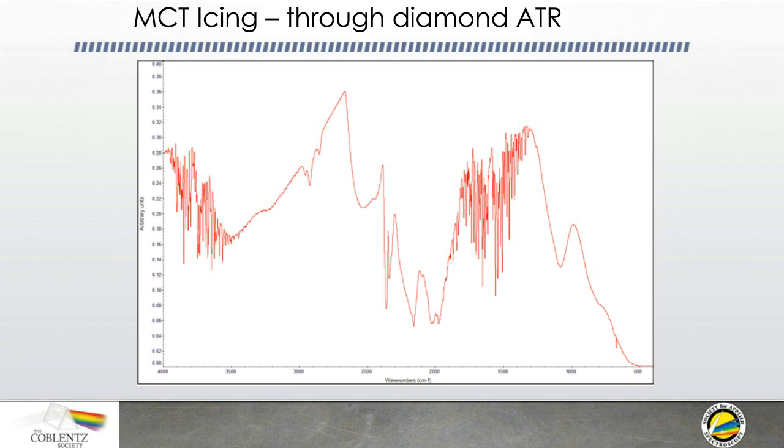Okay. Right around slide 23-24, you mentioned an ASTM standard number, and some folks in our audience wanted you to repeat the standard number so they can write it down. Okay, the ASTM standard is E1421. There are a number of different parts to it. Level zero is the one that is typically implemented by most of the instrument manufacturers.